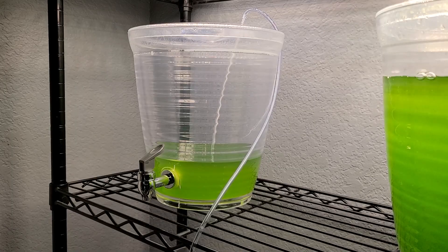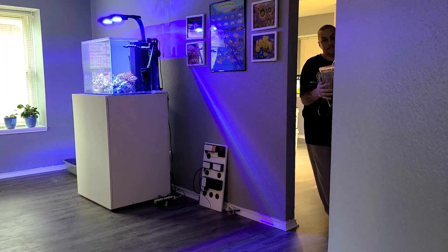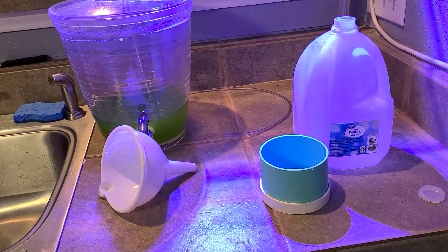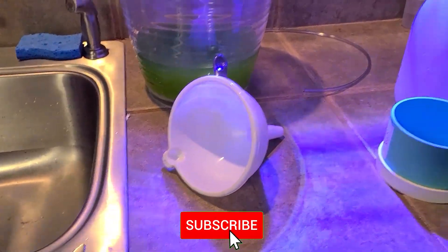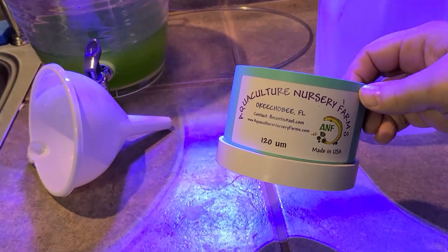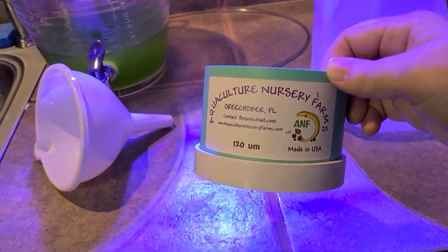Today I'm going to show you how to start up a brand new phytoplankton culture from an existing culture. The items you're going to need are a funnel — this is optional — and a 120-micron filter or sieve. I use this to culture up my copepods.